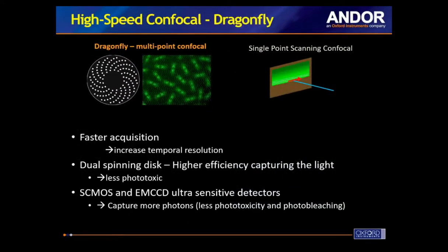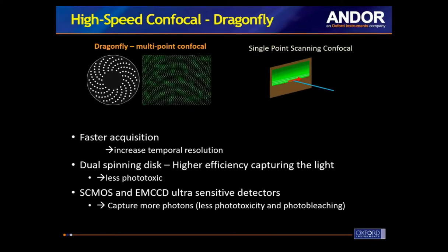You can see the comparison between the DRAGONFLY and the single-point scanning system, where the images in a multi-point confocal are delivered much faster than in a single-point scanning confocal. And with faster acquisition, you increase the temporal resolution of your images.